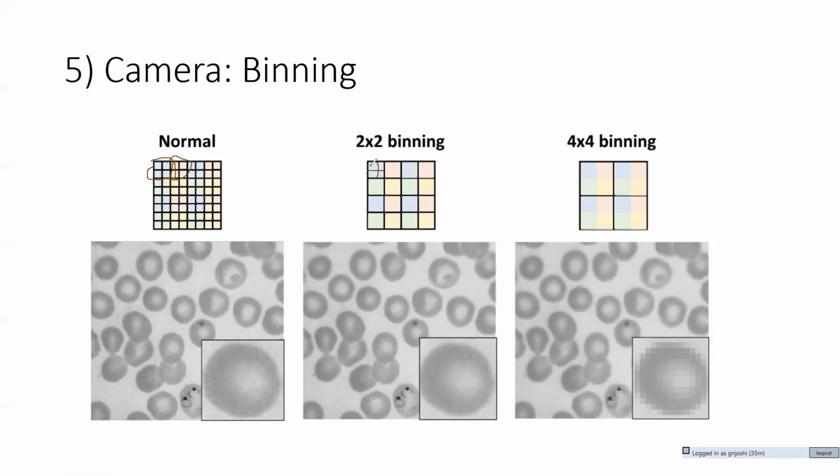When you are looking at a fluorescent image, this also means that all the intensity you are getting on individual pixels over here, here, here, and here is now part of 1 pixel, right? Which means that your image will be brighter if you do 2 by 2 binning compared to your normal scenario. This is something I'll show you when I put the slide on the microscope.